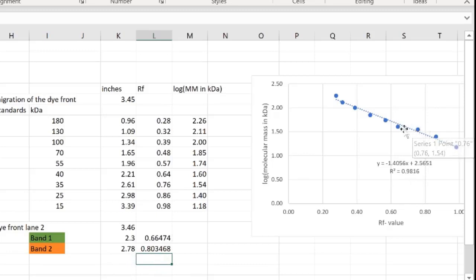In this region, we have a bit of a deviation between our data points from the protein standard and the line. The deviation looks small and the R-square value doesn't look too hideous, but you have to keep in mind that this is based on a log, and later when you do the anti-log, like 10 to the power of the number you obtained for the log, you have a lot of leverage at this exponent. Therefore, any deviation that you have will have a huge influence on your final number. The final number is your estimate of the apparent molecular weight after using the log value in the exponent. But for an estimation, you can say estimated based on trend line.